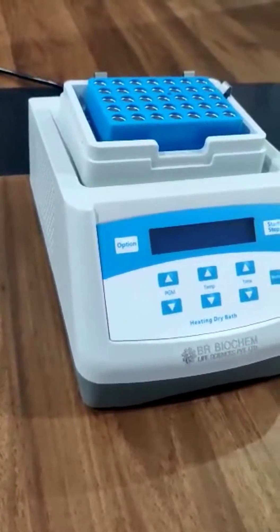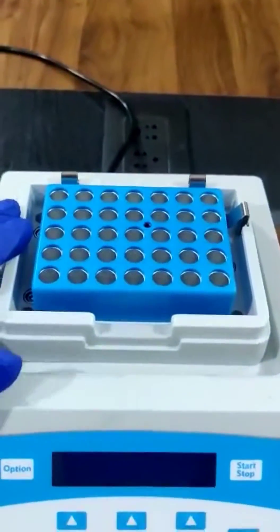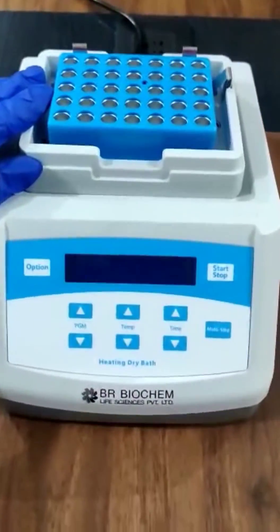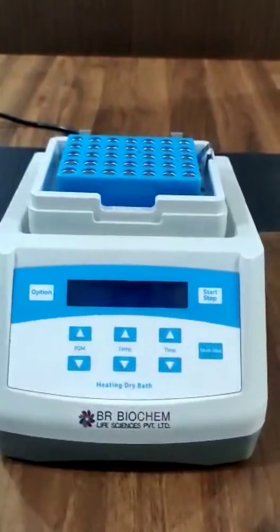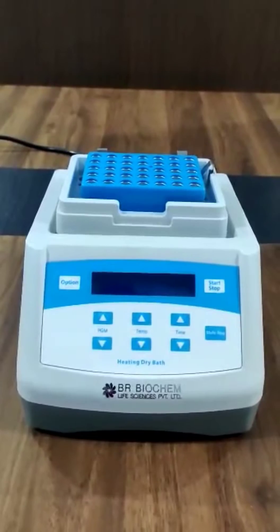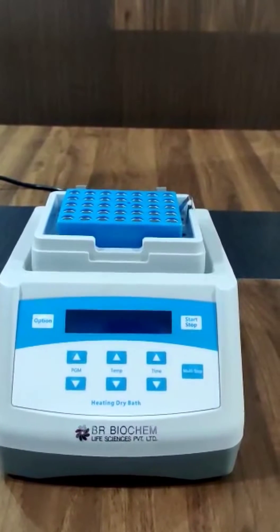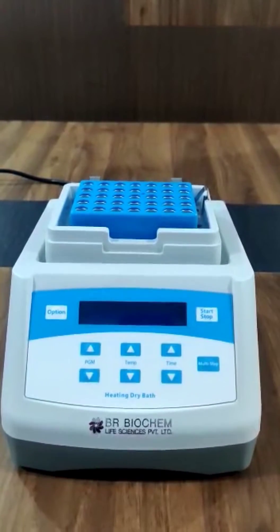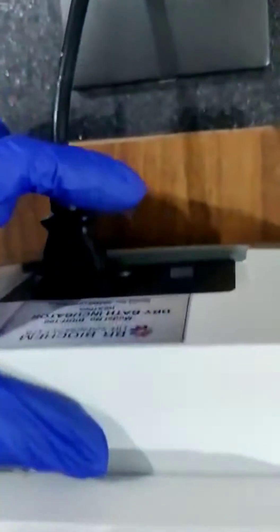In this dry bath, the standard block comes along with it. This is the 35 x 1.5 ml block of the dry bath incubator, meaning you can put 35 tubes of 1.5 ml. We have more blocks also, like 0.2 ml, 0.5 ml, 2 ml, 5 ml, 10 ml, 15 ml, and 50 ml. We also have a 0.2 ml ELISA plate block.